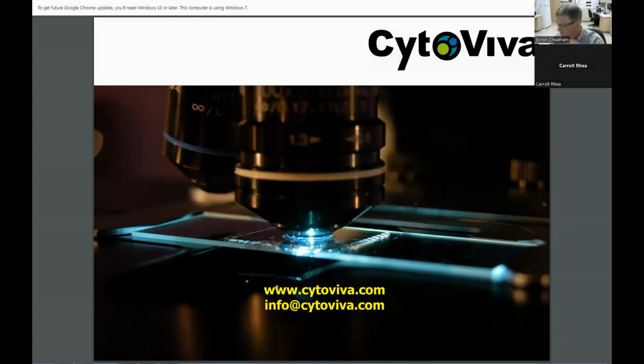Absolutely. We had some really great questions. So here we go. The first one is from Madhu. Is it possible to record a video in Darkfield/Brightfield in the CytoViva Horiba integrated enhanced Darkfield Hyperspectral Raman microscope? If yes, then how? Well, as long as you've got an optical camera that's integrated with that, Madhu, you should be able to do that. Absolutely. There shouldn't be a reason why you couldn't, is the short answer. It just would be a matter of making sure that we had an optical camera that was video capable as part of that system. That should absolutely be possible.